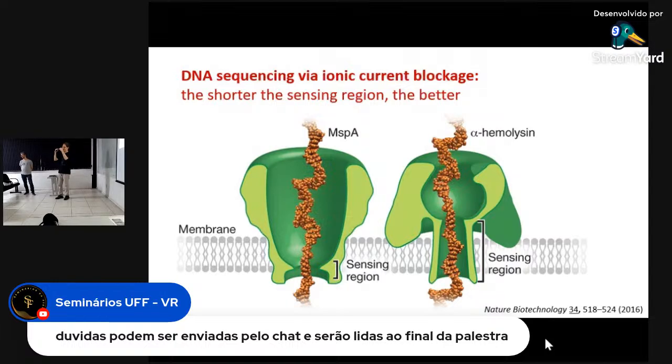In principle, it's as thin as it gets, just one atomic layer thick, or even the bilayer graphene is very, very thin. So one of the advantages of two-dimensional or 2D materials for nanopore sequencing would be this single base resolution. There are many problems to address that make it not so attractive, and that's why it has not been realized yet. But if it can be realized, then the single base resolution is one of the most important positive features of this technology. Did I answer the question?